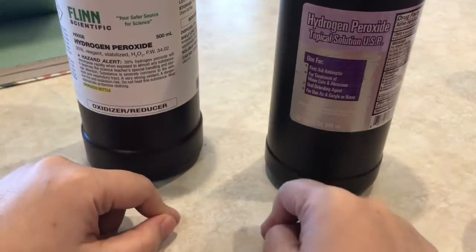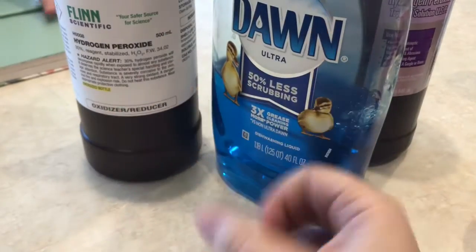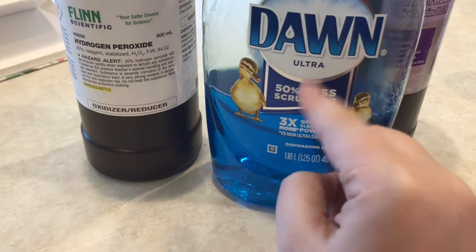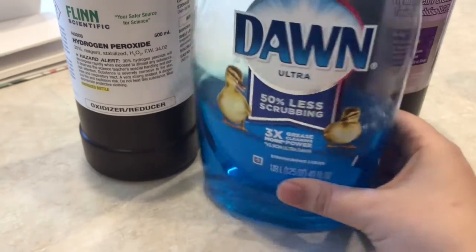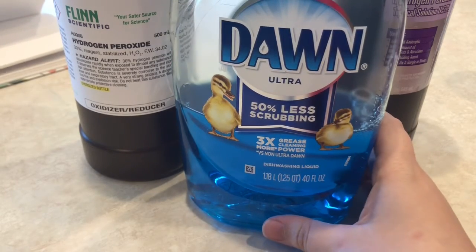The other thing that I need for this experiment is some soap, because the only way we're going to see the actual oxygen that's being released is if we have something to catch the oxygen bubbles. So when this reaction happens, all the oxygen is going to get stuck in this soapy bubble solution. So we're going to see a bunch of bubbles, and that's what actually makes the reaction really cool. So we're going to go outside and do this one in a minute.